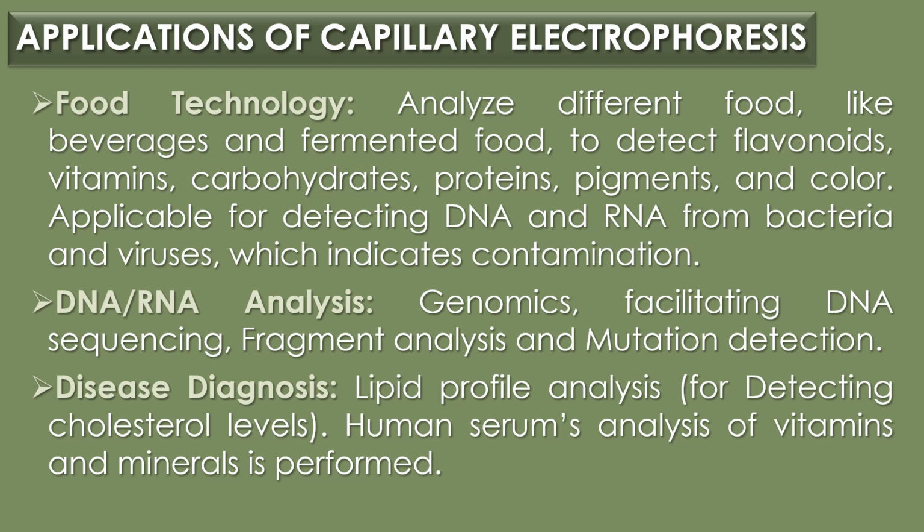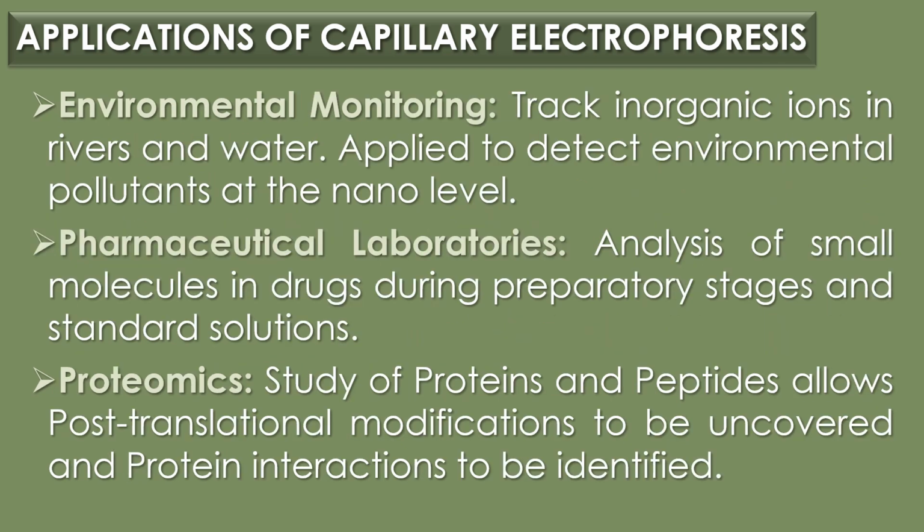Likewise, human serum analysis of vitamins and minerals is performed using capillary electrophoresis. The fourth application is environmental monitoring. Capillary electrophoresis has been applied to track inorganic ions in river and water. Likewise, nanocapillary electrophoresis is applied to detect environmental pollutants at a nano level.